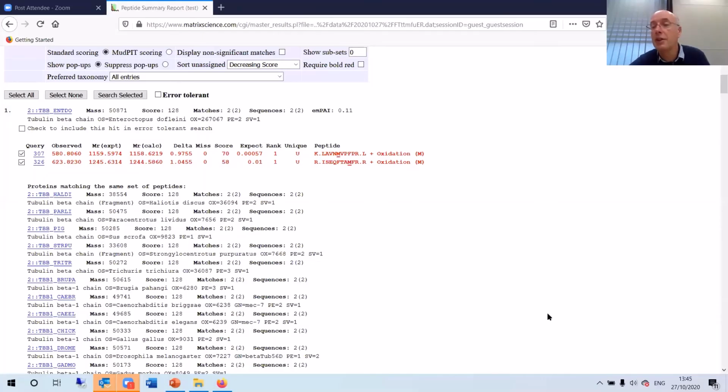Okay, let me show you the peptide family. And what we have here is tubulin, and you can see we have the same set of peptides, so the same score. Share your screen again, please. Oh, sorry, I apologize. I keep on forgetting to do this. Yeah, just a minute. Can you see my screen now? Yes, thank you. Yep, okay.